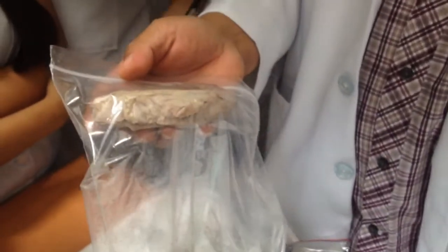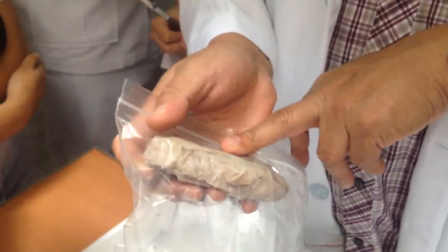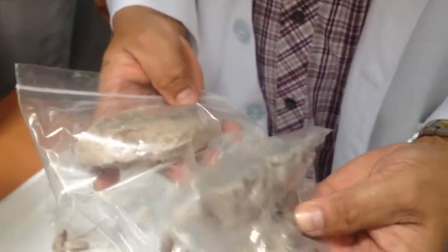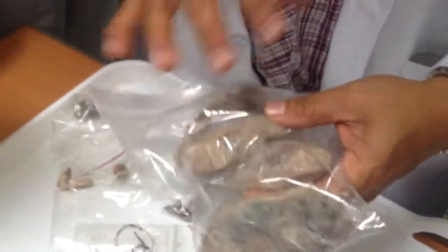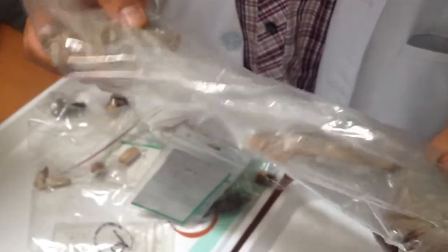So this is an example of your phyllodes tumor. Again, to determine whether it is benign or borderline or malignant will rest on the histology. No? Mitosis, overgrowth, pleomorphism of cells. By the size, if it is more than 5 cm, phyllodes will be the consideration rather than fibroadenoma. If it exceeds 10, you have to consider already at least low-grade malignant or malignant phyllodes.